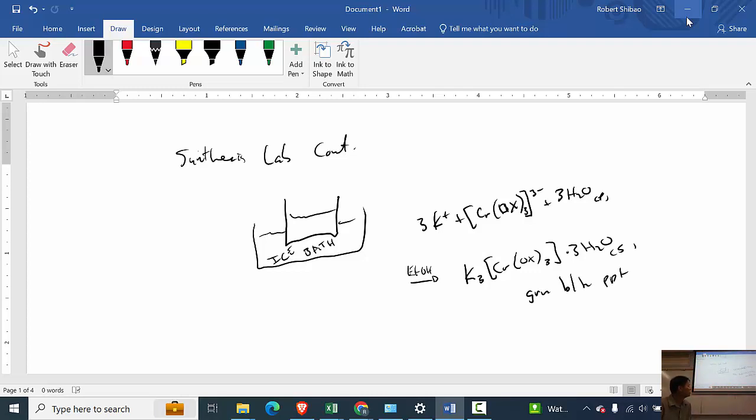But what we don't want to do is make this go too far, because if we add, let's say, too much ethanol, do you know what could possibly happen? What could possibly happen is co-precipitation. And so we do not want co-precipitation. So avoid co-precipitation with the other stuff. The other stuff is what we added excess of.